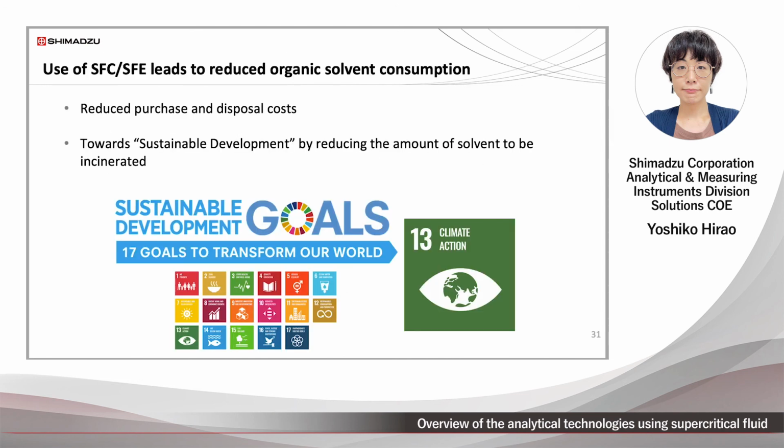Reduction of solvent consumption reduces carbon dioxide emissions as well as cost. We believe SFC can be an analysis method with a reduced environmental impact due to the use of recycled carbon dioxide. Shifting to analytical technologies using carbon dioxide leads to the United Nations Sustainable Development Goals. I hope that this session will inspire you to position SFC and SFE as one method of analysis that can achieve green analytical chemistry.